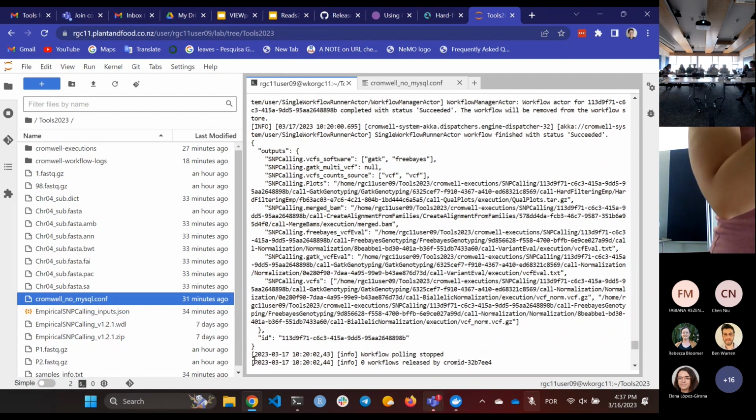And now we will do the dosage and the linkage map. I couldn't subset the population because if I did that, we would not have any results. Instead, I subset the chromosome, to just a single part of a chromosome. And that's why you need to download a VCF file. Theoretically, in real situations we would take the VCF files that are output from these workflows and keep going with the other workflow, okay? But in this case, it's not connected because of the subsetting.